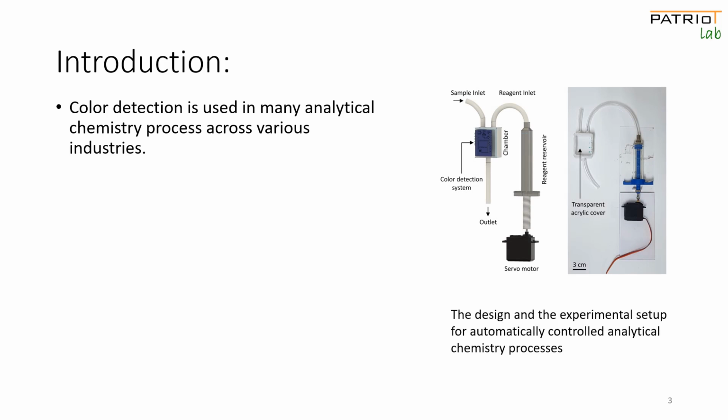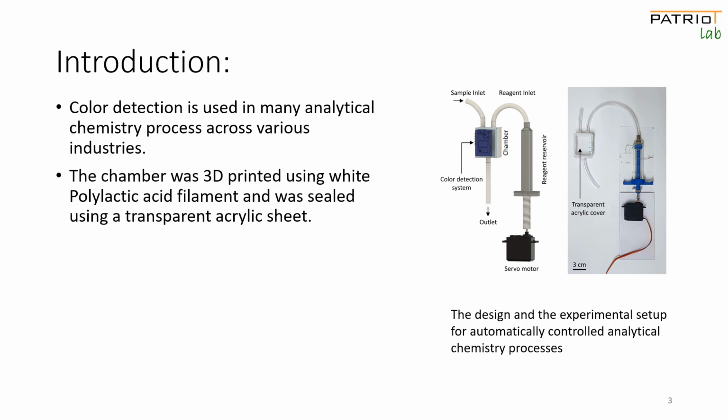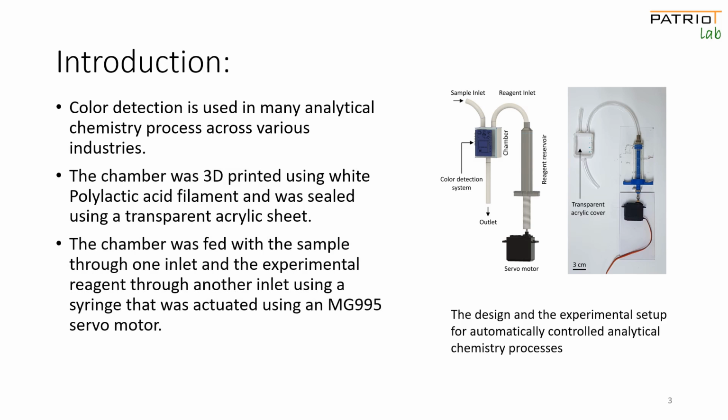Both the approaches were tested using the experimental setup as shown here that consists of a test chamber to accommodate the liquid sample. The chamber was fed with sample through one of the inlets and the reagent was then injected through another inlet using a syringe piston.